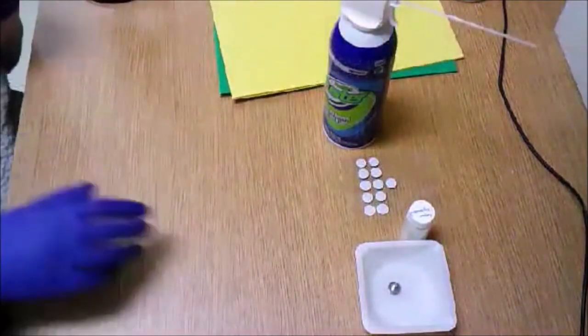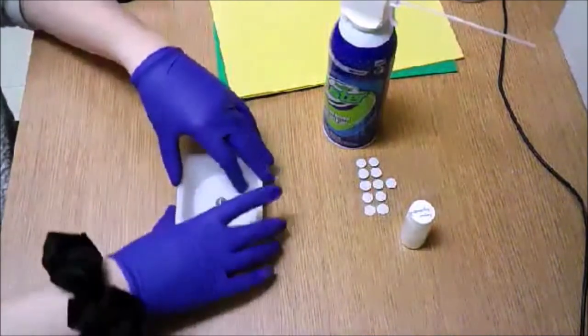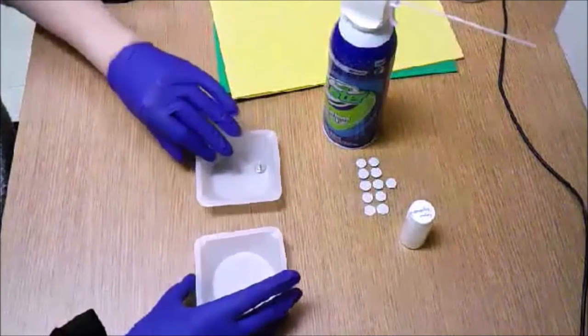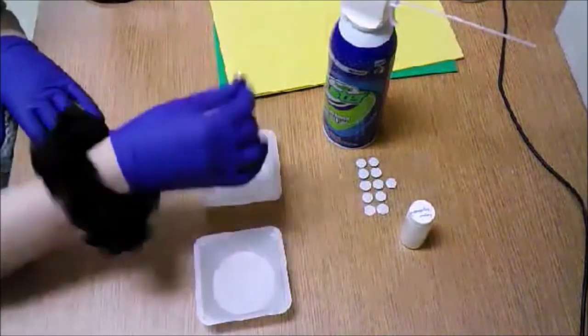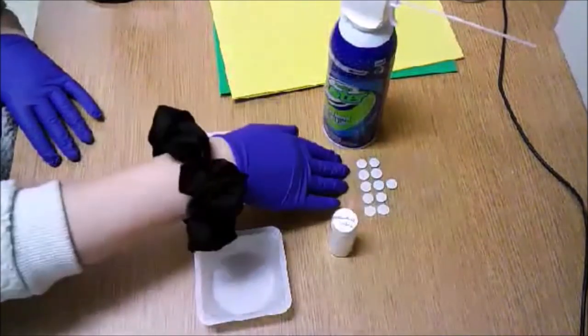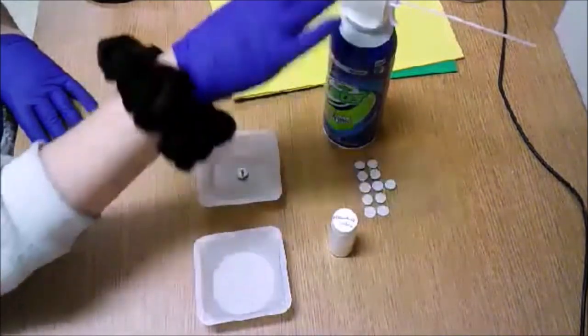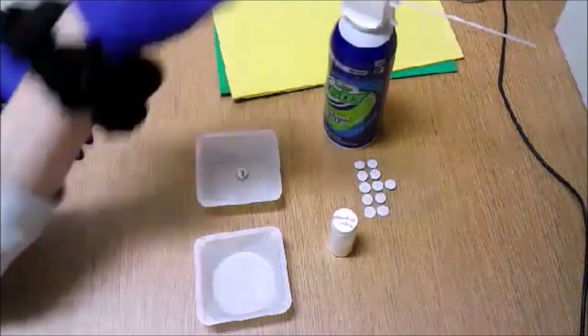Now we are going to move on to sample preparation. Today we are simply going to be using powdered sugar. I have two weigh boats, our sample stage, our sample, carbon double-sided tape, and canned air to get rid of excess sample on our stage.